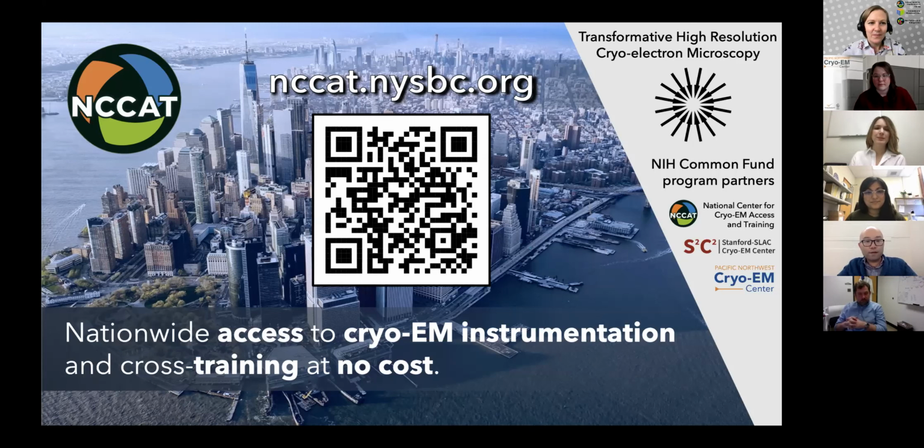Thank you, Ed. And I'm gonna ask you to do double duty and just say a quick thing or two about S2C2. Okay, so for my colleague, Mike Schmidt, who can't come right now, S2C2 is equipped with 3 Krios instruments, alpha, beta, and gamma. Alpha actually has a Selectris and the Falcon 4. They also have other microscopes, including an Arctica for training and specimen screening. Something that's upcoming in January is their user meeting, so I'm sure you'll hear about that soon.